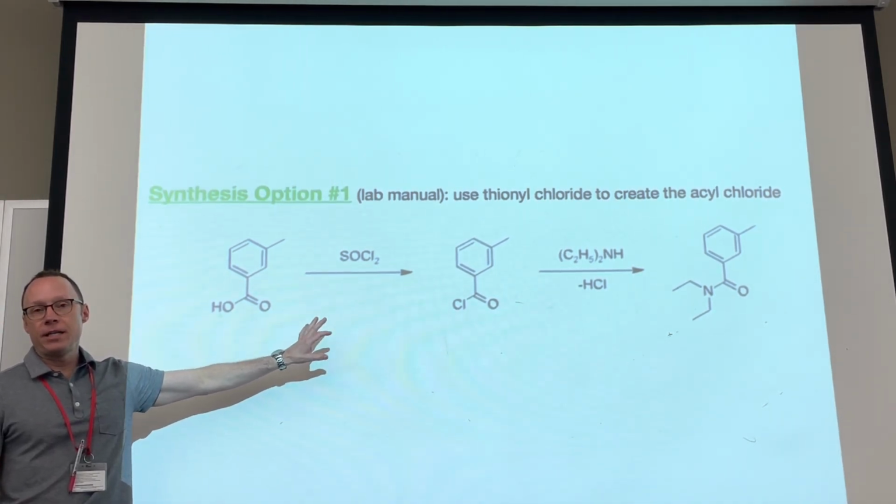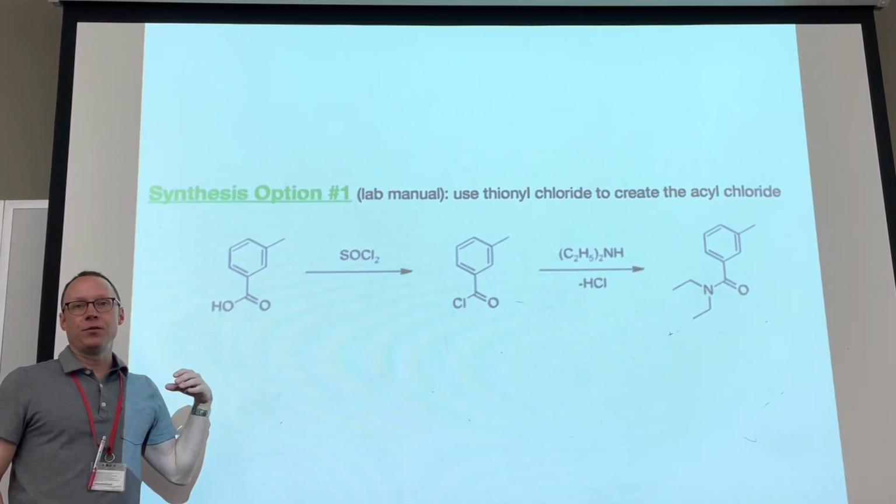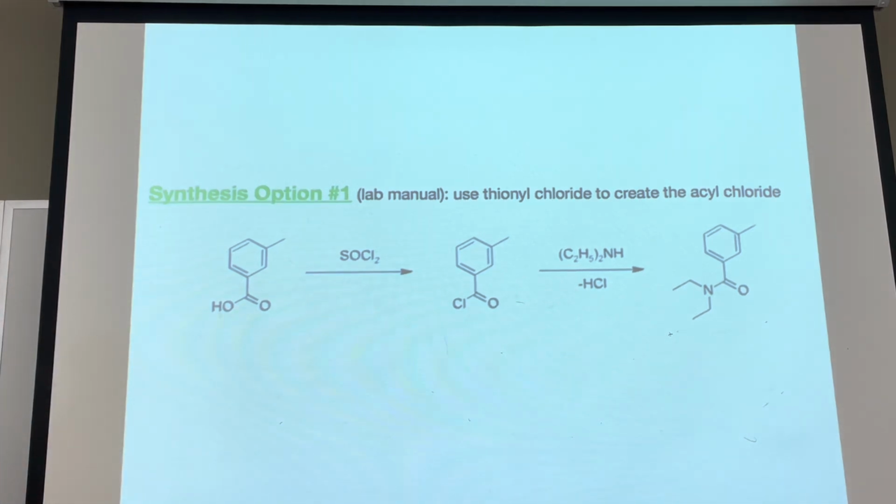Now, thionyl chloride is something you have to be a little bit careful with. If you are looking at your procedure, all of you will be building an apparatus. You don't really want to use thionyl chloride in the open air because it decomposes readily to give you HCl gas, which you don't want to breathe in, and sulfur dioxide gas, which you also don't want to breathe in because it stinks to high heaven. So you're going to build this self-contained apparatus as described in the lab manual.